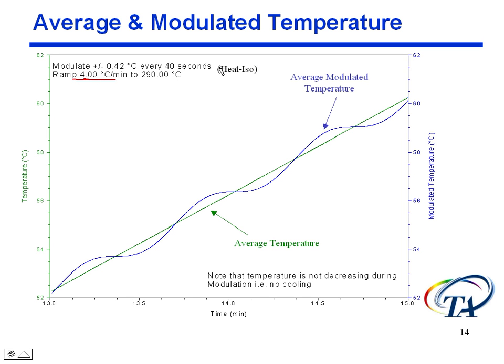Now these conditions here, this plus or minus 0.42 every 40 seconds, you might look at that and say, why in the world would you use 0.42 instead of just 0.4 or something round? This is what we know as heat-iso conditions. We're going to talk about this further, and there's an important reason why we would want to use this and when we want to use it.